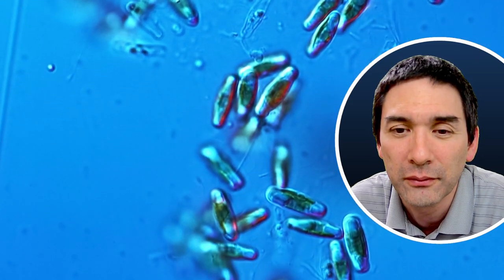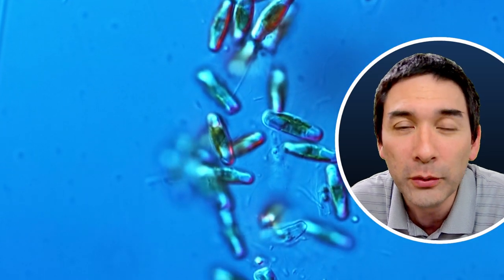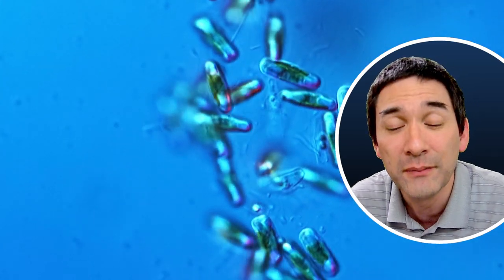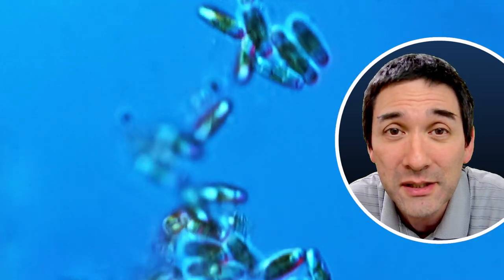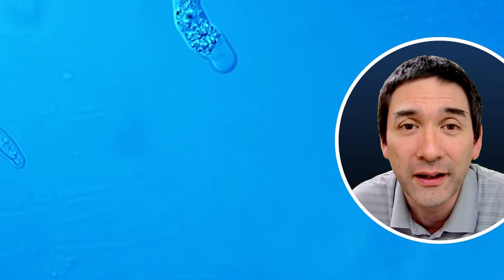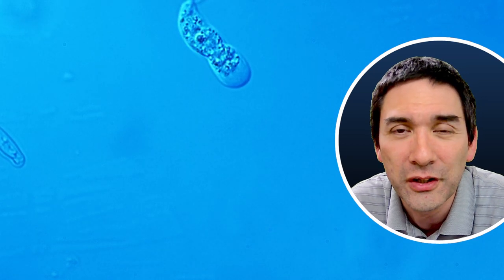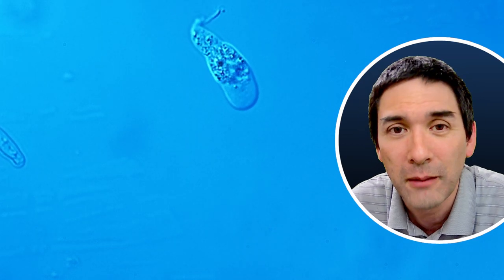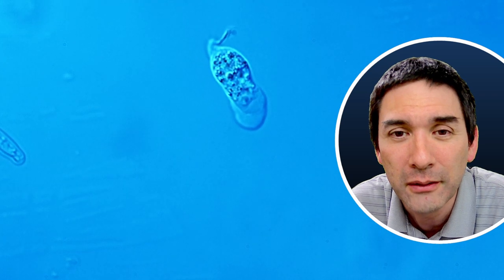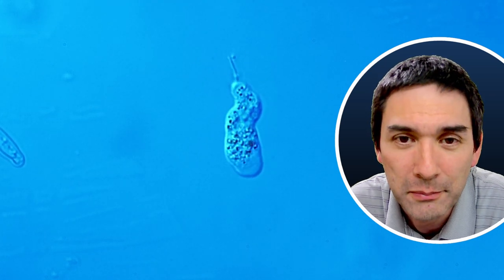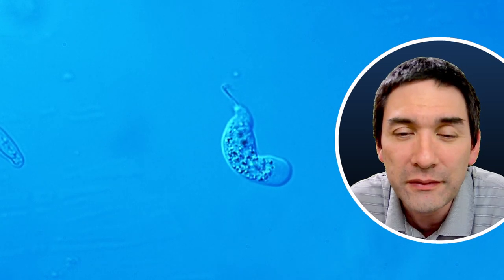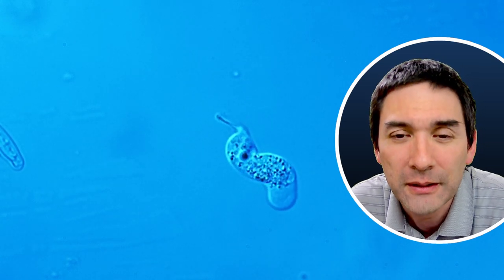Not only here, we see again a whole bunch of diatoms that are found there. But not only, chances are pretty good that if you find diatoms there in the biofilm that you are also able to find other microorganisms. And indeed, I did find this little cell over here, as a matter of fact, a few of them. They're also like amoeba. Maybe they are amoeba. And they move, actually, they should be because that's how they move around. And even here, you're able to see some of the cell organelles.